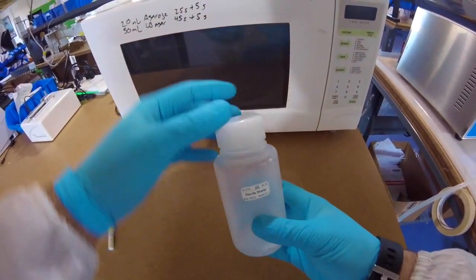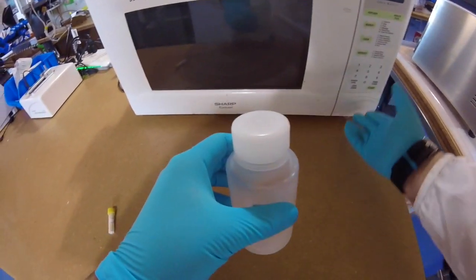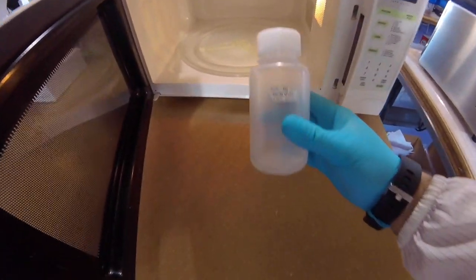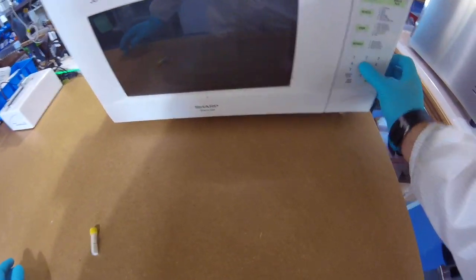Okay, so I'm going to loosen the lid here so that when it boils, the vapor can escape and it won't explode. I'm going to put it in here, and I'm going to go 45 seconds. Try and get close here.